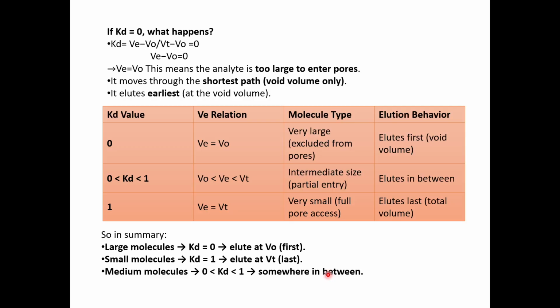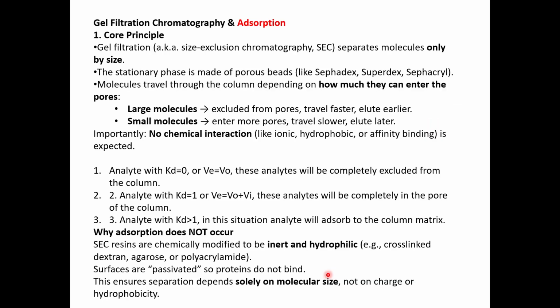So next is regarding adsorption in the case of gel filtration chromatography. Like we know, gel filtration is basically size exclusion chromatography and it separates only by size. So there should not be any kind of adsorption in this whatsoever. There is no chemical interaction, no bond formation, and charge-based attachment should not be there.